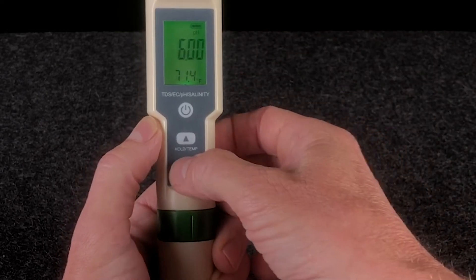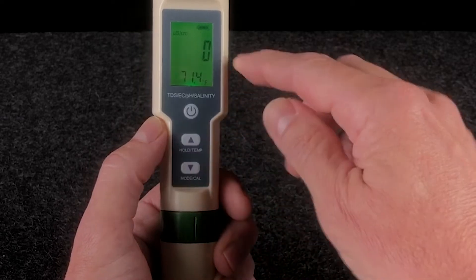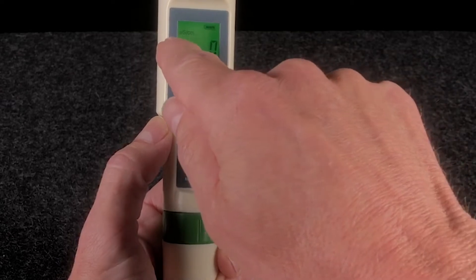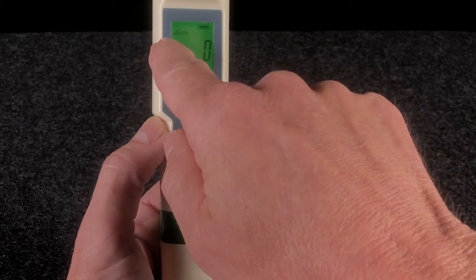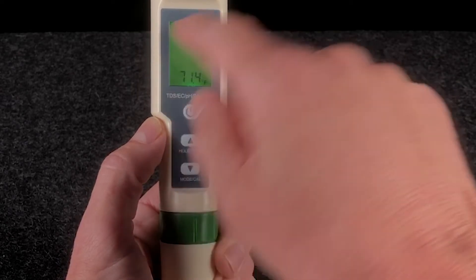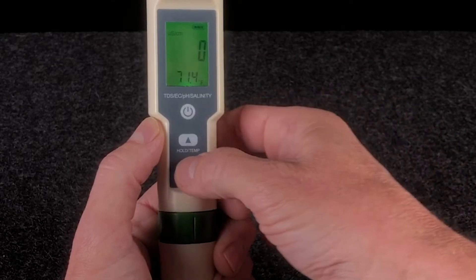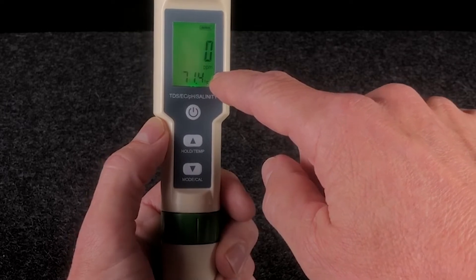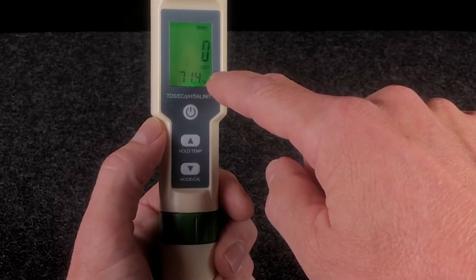Pressing the mode button one more time brings us into electrical conductivity mode. That's indicated by micro Siemens per centimeter, which is displayed in the top left of the display. Hitting the mode button again places us back into normal TDS mode, registering with parts per million on the display.